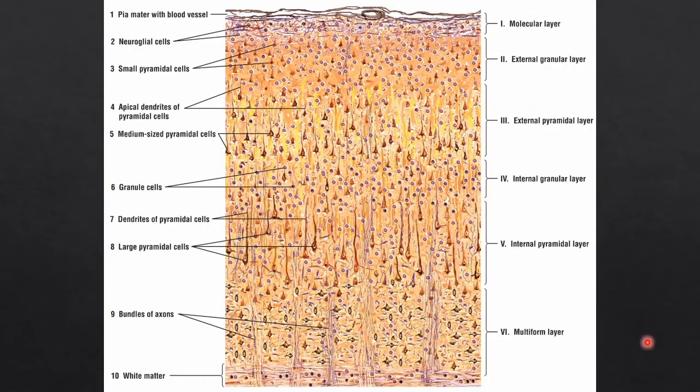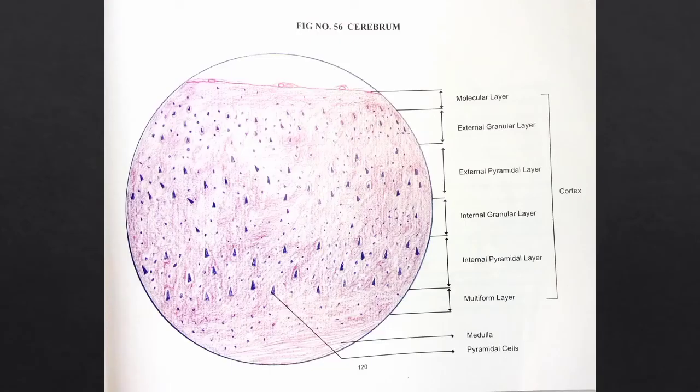Next, we are moving to the nervous system. In the nervous system, we are going to see two structures, the cerebrum and the cerebellum. Now, for the cerebrum, the picture projected here is actually a special stain, a Cajal stain. How to identify the cerebrum is very easy, because all the pyramidal shaped cells we can identify; that itself gives you a clue to identify this particular cerebrum.